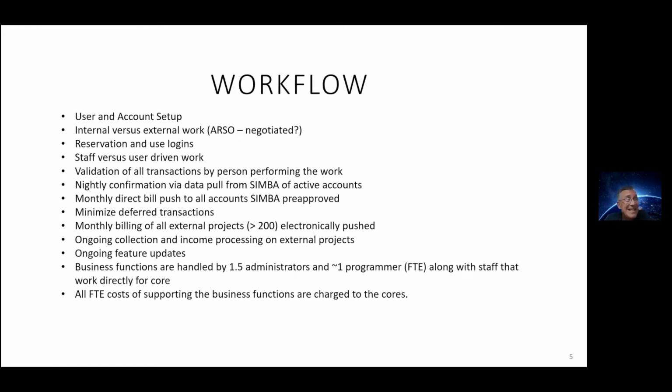We are continually bombarded with feature updates from users, faculty, staff. I would say mostly it's staff driven, because they're the ones dealing directly with the users and know what's happening and what we can do. We also closely follow the NEMO updates and put those on our list of feature set updates and work through those continually. Have a plan, have a list, and prioritize those regularly.